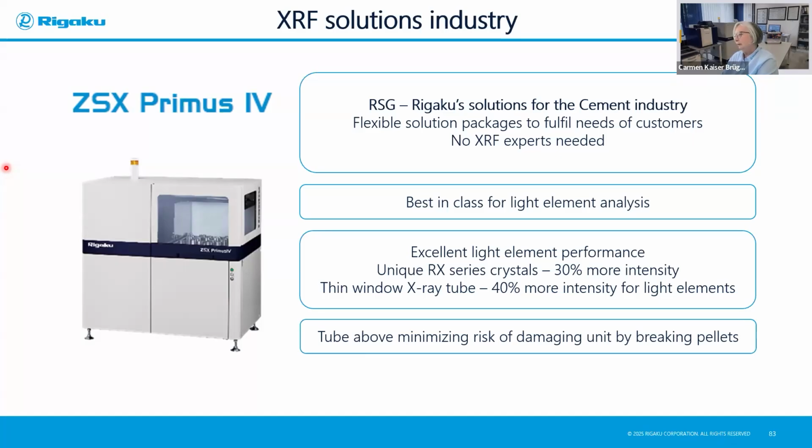So we need to be careful which kind of method that we choose. To get reliable results, I would always rather recommend to just use the press powder method. But then we have to always ensure that we have the best possible particle size and mineralogical matching of standards. So this is my recommendation.